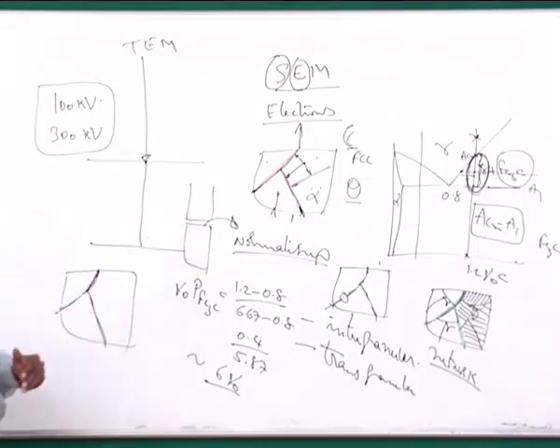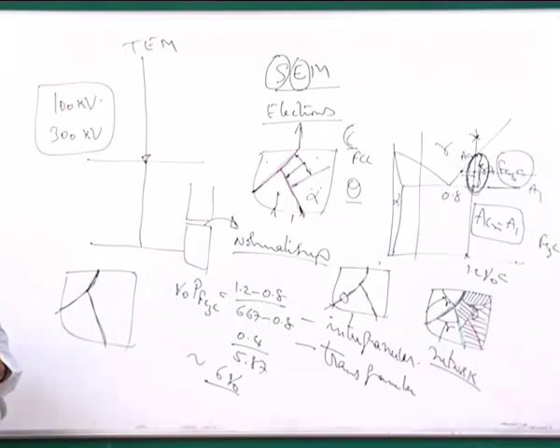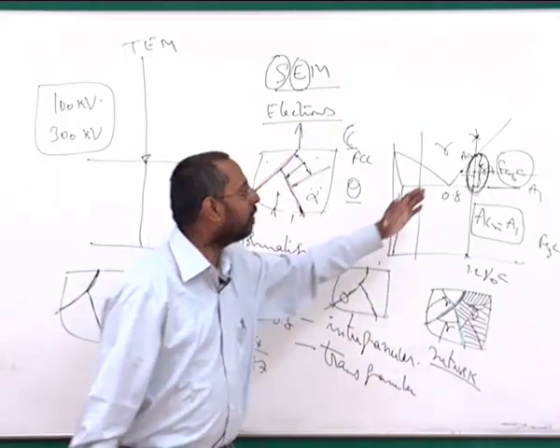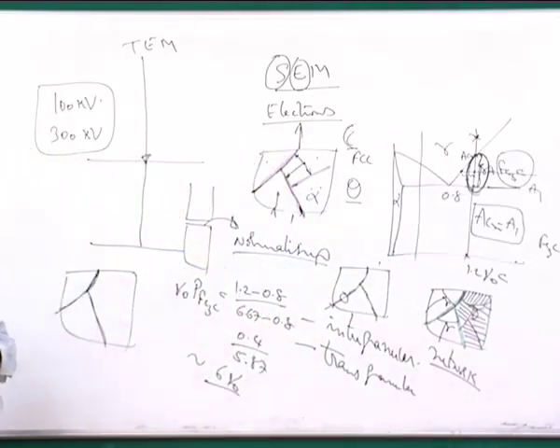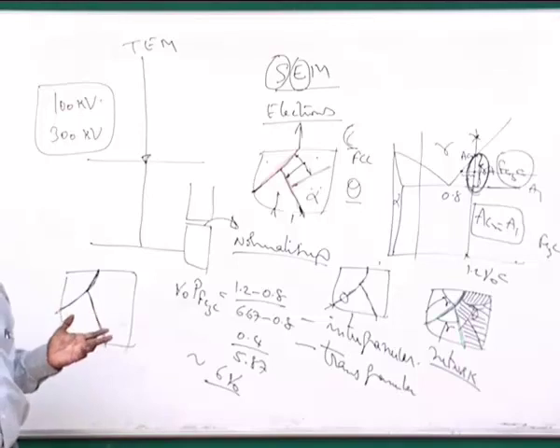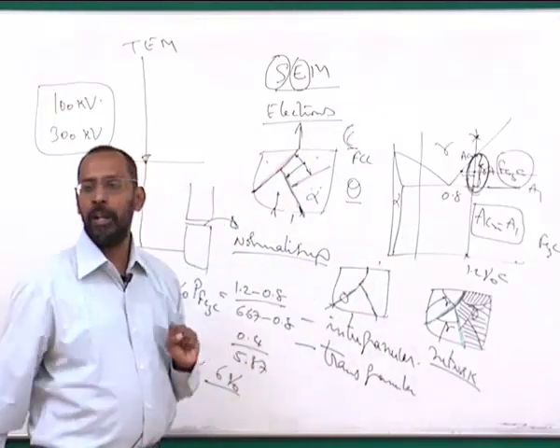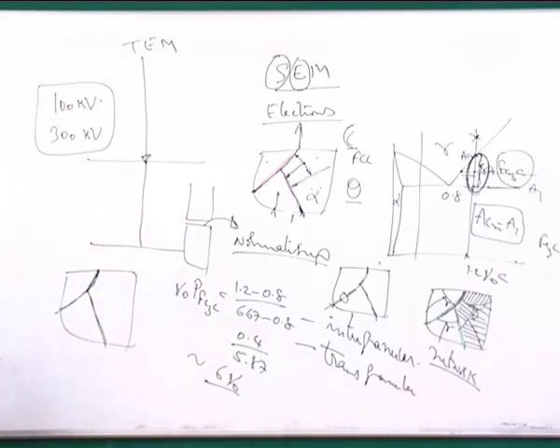So that's why normalized microstructures, particularly in high carbon steels, are not as brittle as an annealed microstructure in the case of high carbon steel. Usually you expect that annealing should make a material soft, whereas in the case of high carbon steels, actually it is the reverse: annealing will make the alloy very brittle. If you do normalizing, it will give you some ductility. So this is one way to do this.